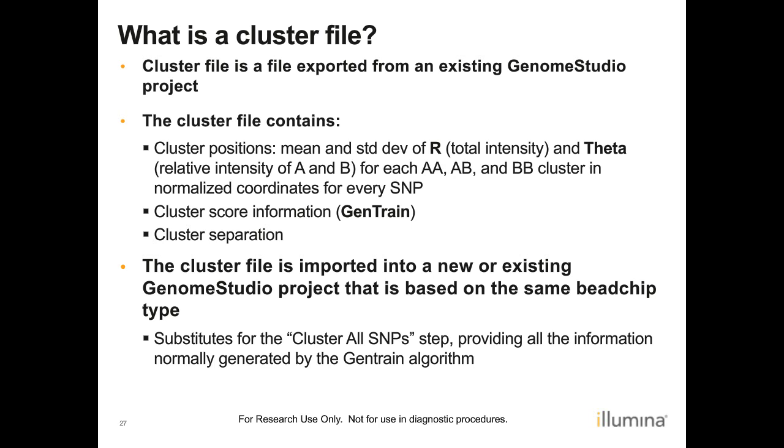The cluster file is generally imported into a new or existing GenomeStudio project that is based on the same bead chip type. So if you create a cluster file from a project, you can import it into another GenomeStudio project as long as that project is based on the same type of chip. So it substitutes for the cluster all SNPs step, providing all the information normally generated by the GenTrain algorithm.